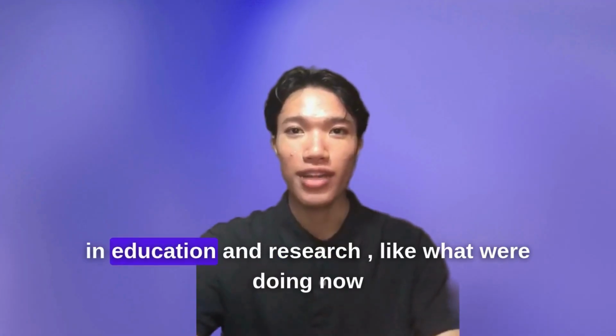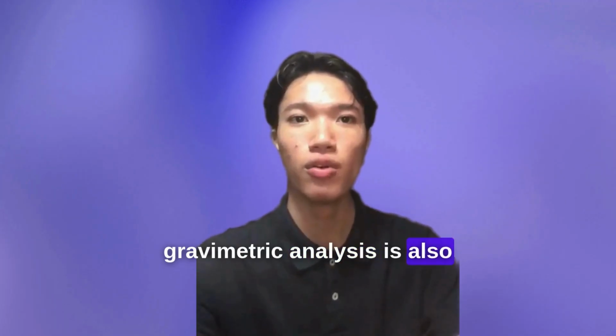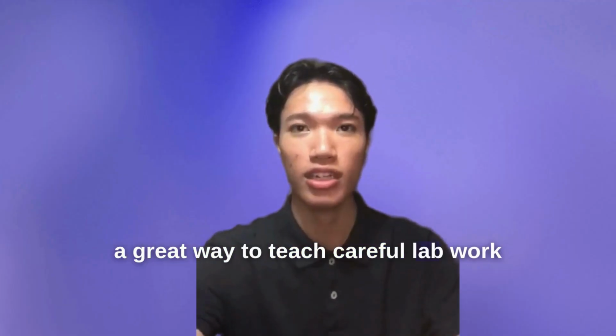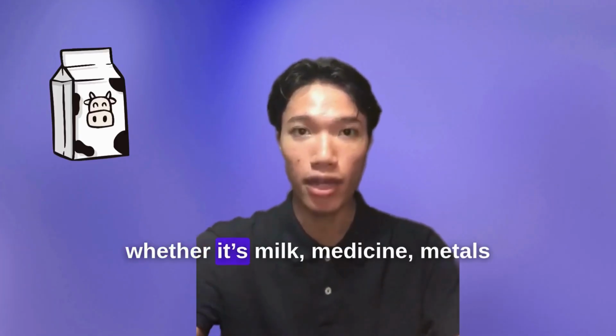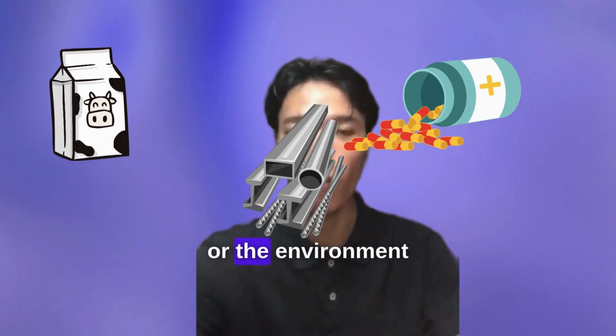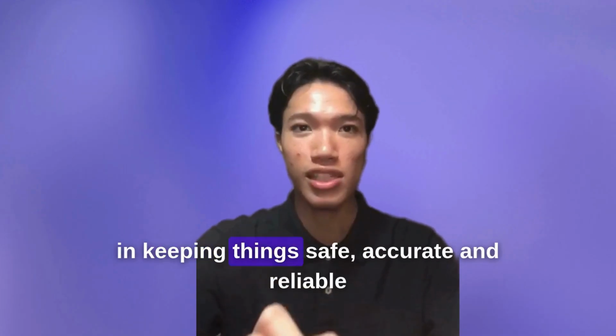And of course, in education and research like we are doing now, gravimetric analysis is also a great way to teach careful lab work, accuracy, and chemical understanding. So whether it's milk, medicine, metals, or environment, gravimetric analysis plays a big role in keeping things safe, accurate, and reliable.